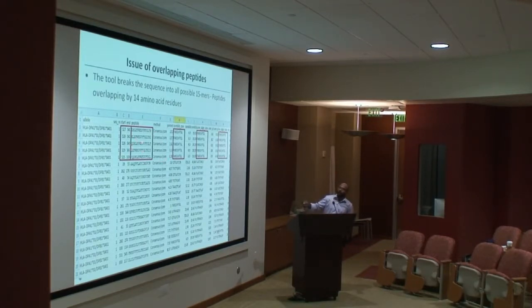When you look at this result closely, you will see that these top peptides, the top percentile rank ones coming from this sequence, start at 526, 527, 528, 529. Essentially, they are redundant, right? You don't need to synthesize all these peptides. Why is it like that? Because the binding core within them is the same for different peptides.